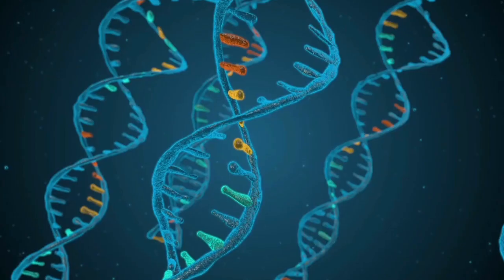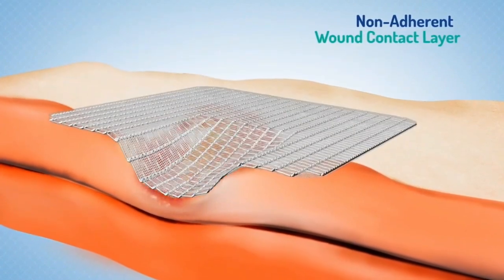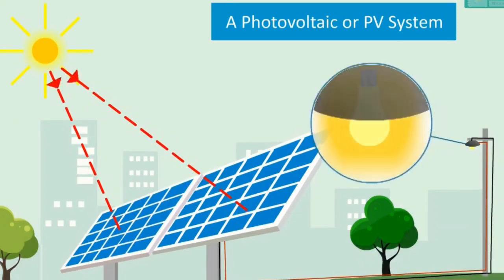The applications of photoelectron spectroscopy are vast, with benefits in fields such as geology, biochemistry, and material science. In medical research, it verifies the presence of antibacterial silver in wound dressing. In energy storage, it helps us understand the degradation of solar cells, and in basic chemistry, it unveils the secrets of phase transition and crystal nucleation.